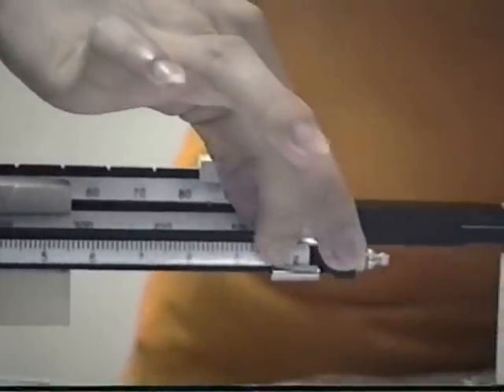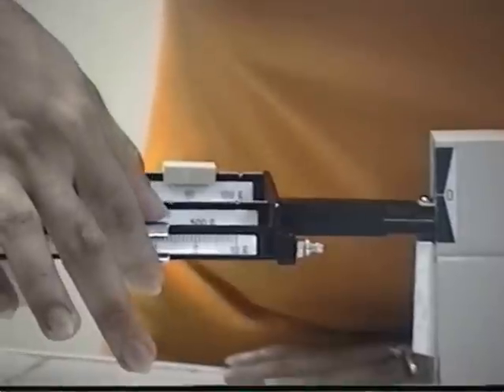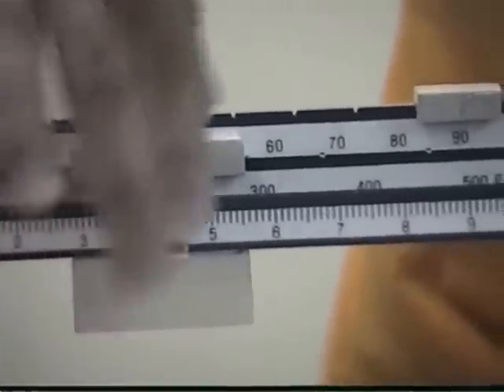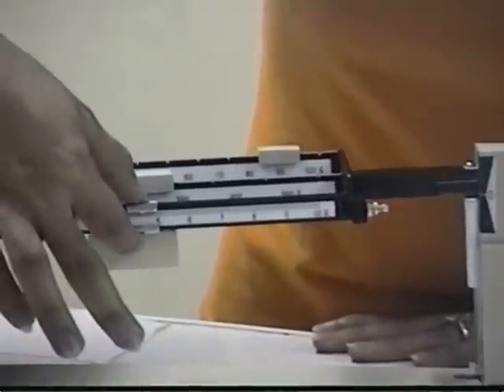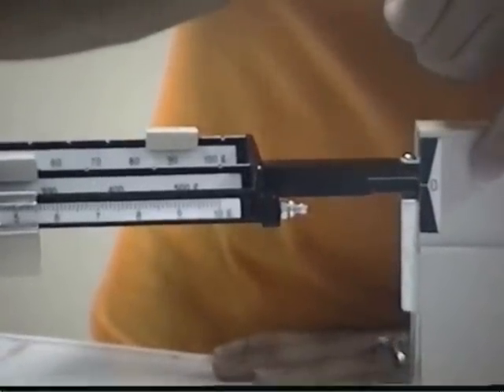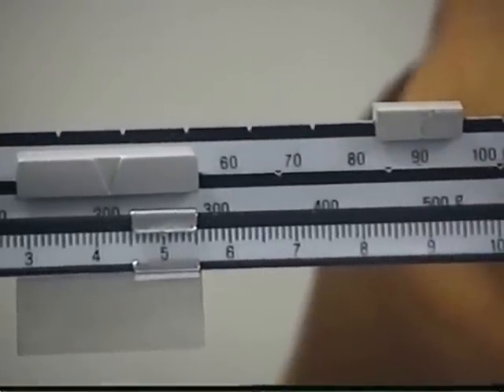So we use the fine slider. Let's try 10 — it is not quite right, so we adjust. Let's try 8 — the pointer doesn't move. Let's adjust to 5 — as you can see, the pointer is now on the scale. So it means that the mass of this object is 295. Again, the measure of this object is 295.